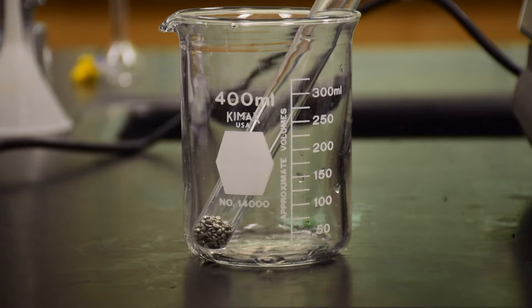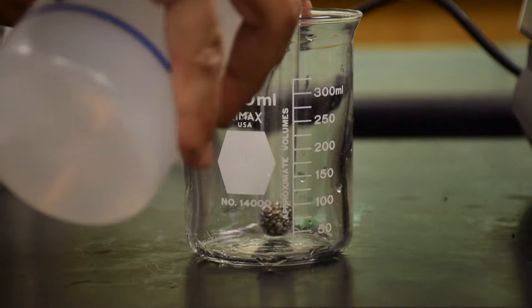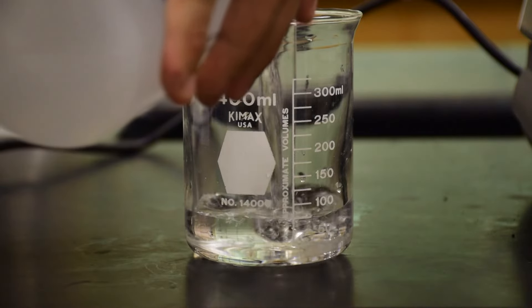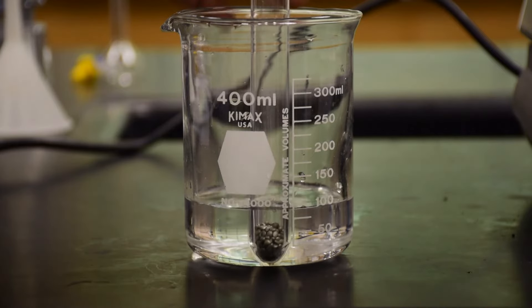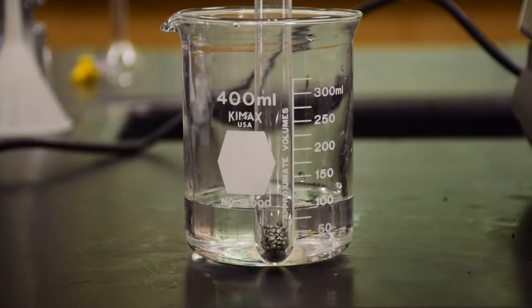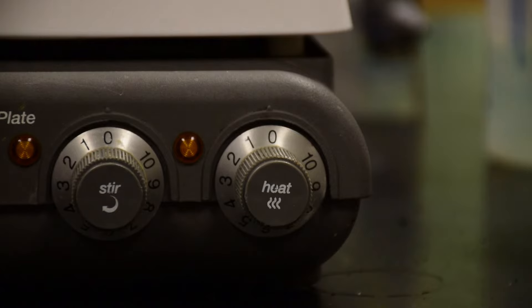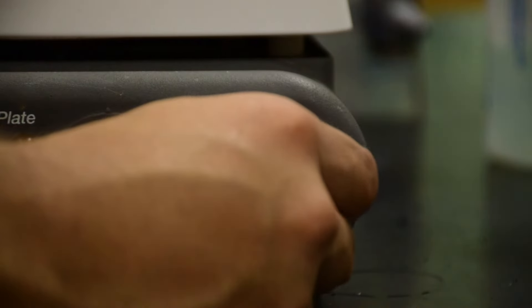Then you want to get a 400 milliliter beaker and fill it with water up to above the level of the metal in the test tube. Then, turn on the hot plate to a level of 7 to 8 and boil the water.